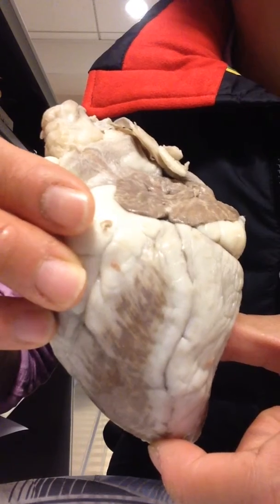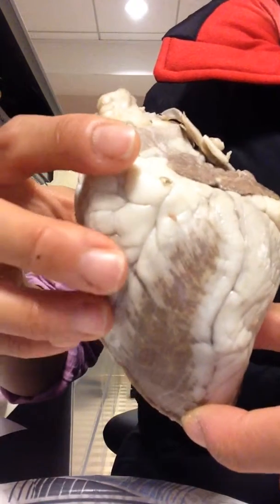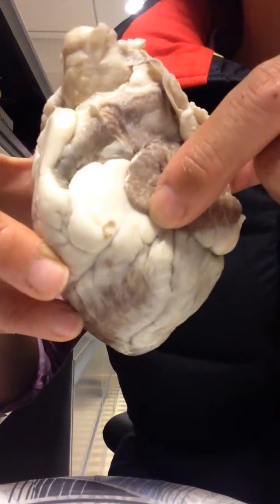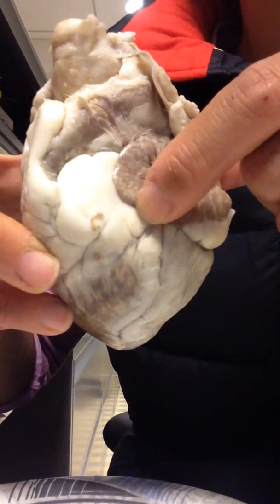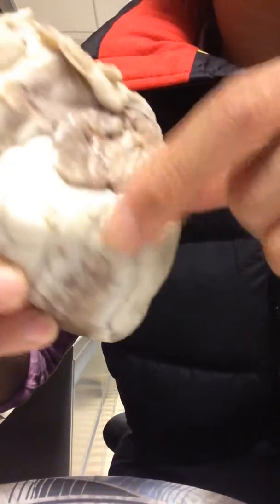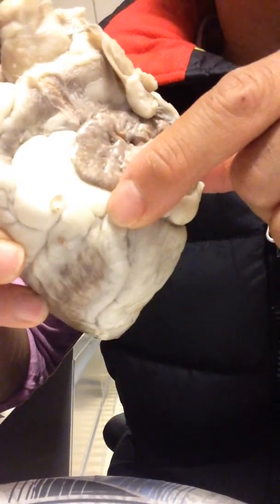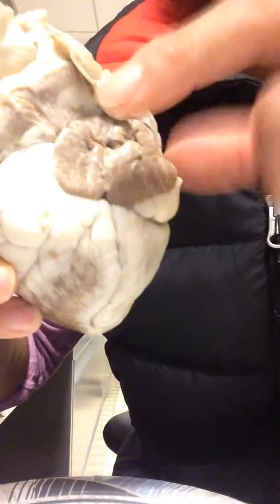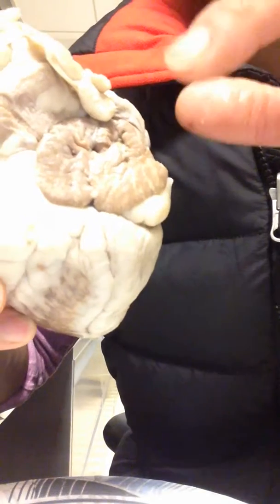On pulmonary trunk, let's see, the pulmonary trunk is located right here. Somewhere right here. And the question is, where is the blood going to? Is it deoxygenated or oxygenated? It is deoxygenated. At the base of the pulmonary trunk, there's a valve that opens when the right ventricle contracts. When the right ventricle muscle relaxes, the blood goes back up to the pulmonary trunk, and then at that point the valve closes to prevent backflow.